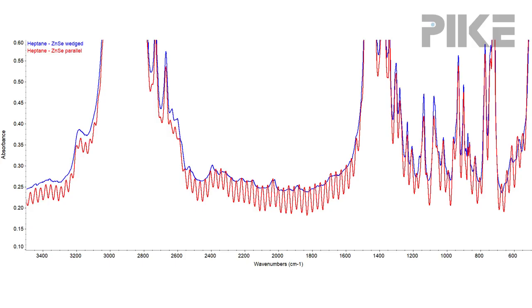So let me offer a solution. Let me show you a heptane spectrum collected using the wedge windows, and now you can see that fringing along the baseline is gone.